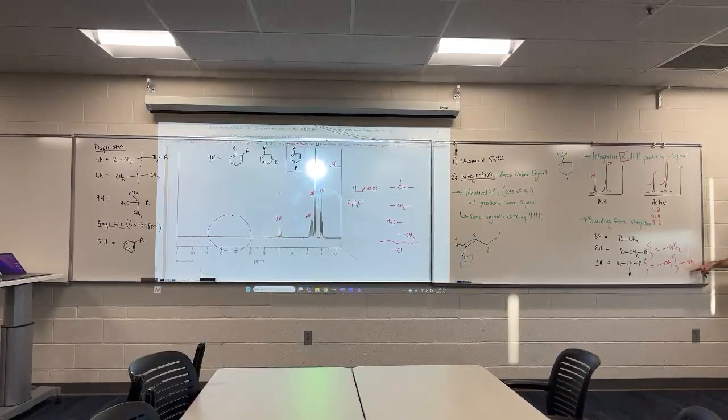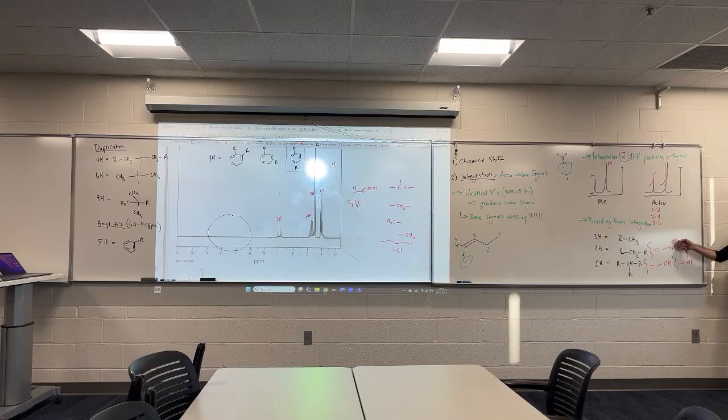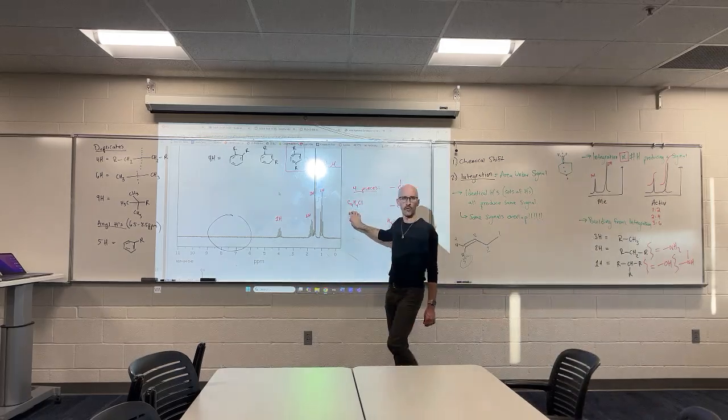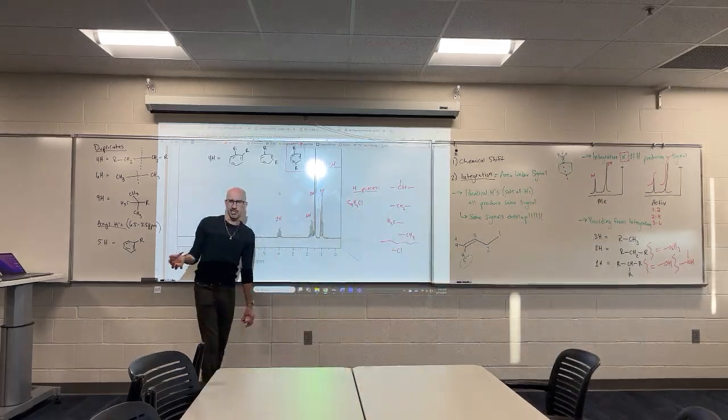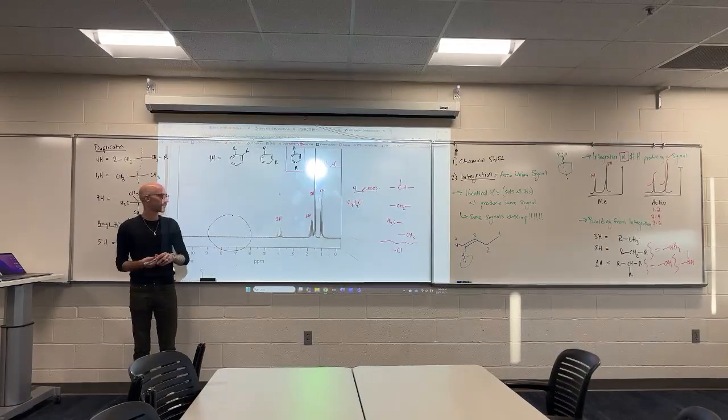This could be an amine or an amide. We actually wouldn't know the difference by the chemical shift necessarily, but these are other ways that I can get 1H integrations. Does that track? Do you guys agree? Alcohol gives 1H, secondary amine, 1H, primary amine, 2H. These are things that you might be able to look for if you know the chemical formula. But you wouldn't actually know if they're bonded to carbon or some heteroatom.